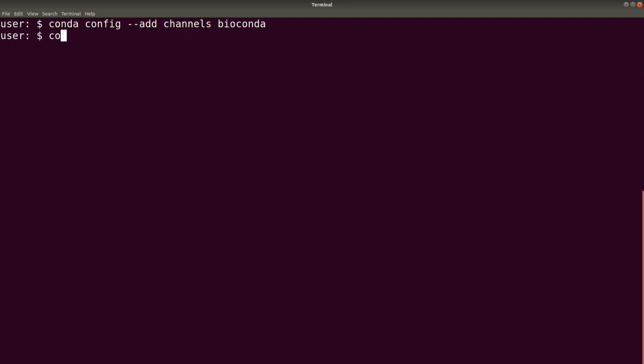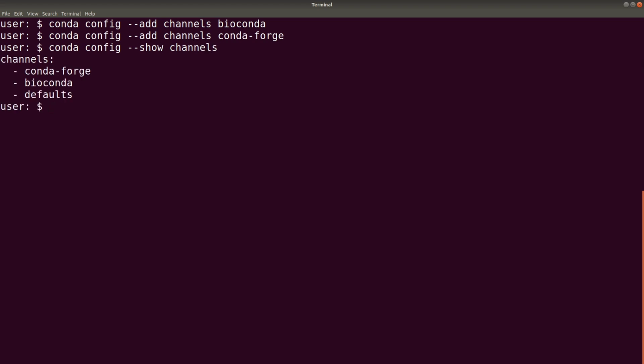We add a second channel, which is conda-forge. Okay, so that is how channels are added. Let's show the channels. Okay, yes, so we have them added.